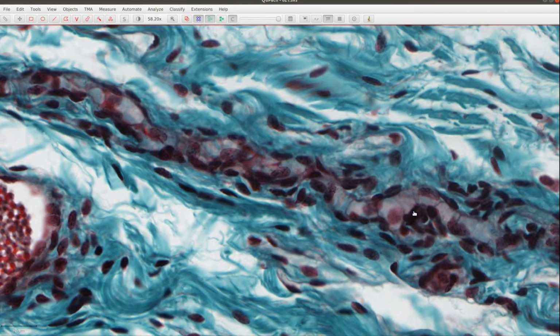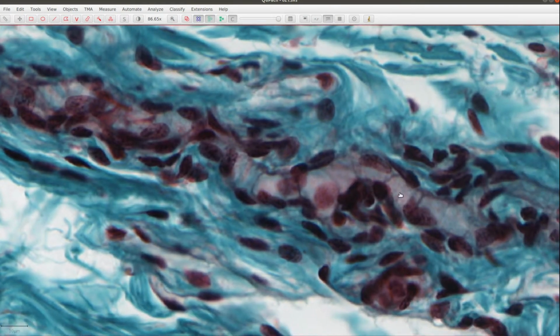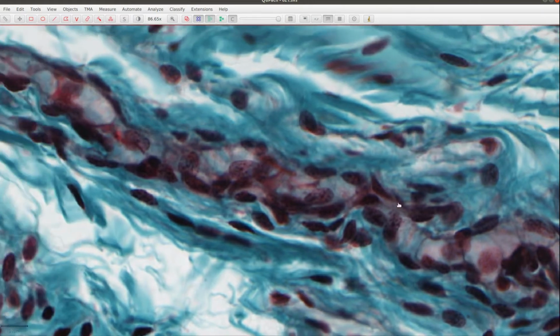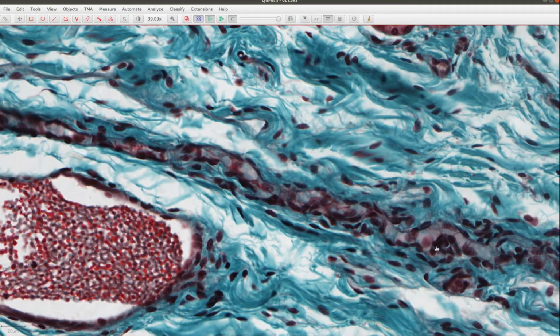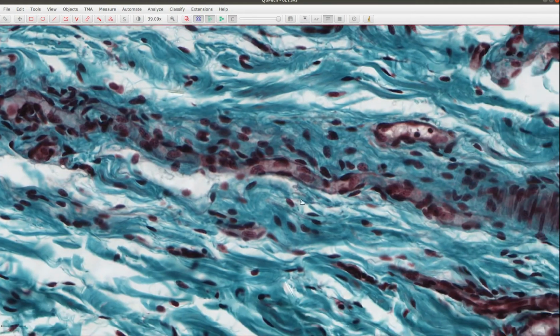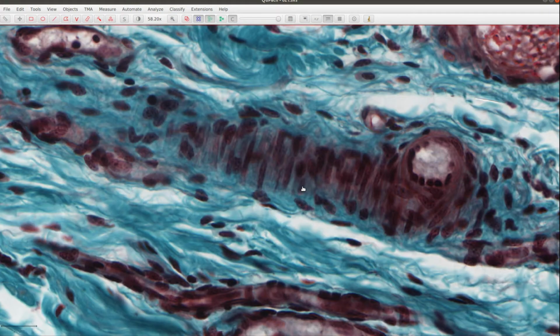And then you might be able to catch the odd smooth muscle cell. For example, this one here is quite convincing as a smooth muscle cell. Now, because it's cut longitudinally, we might get some of the smooth muscle that was on top of the vein. So this is probably a smooth muscle cell in the tunica media on top of the venule that's just been sliced in the longitudinal section. If we follow it along, we'll get kind of an odd structure like this.